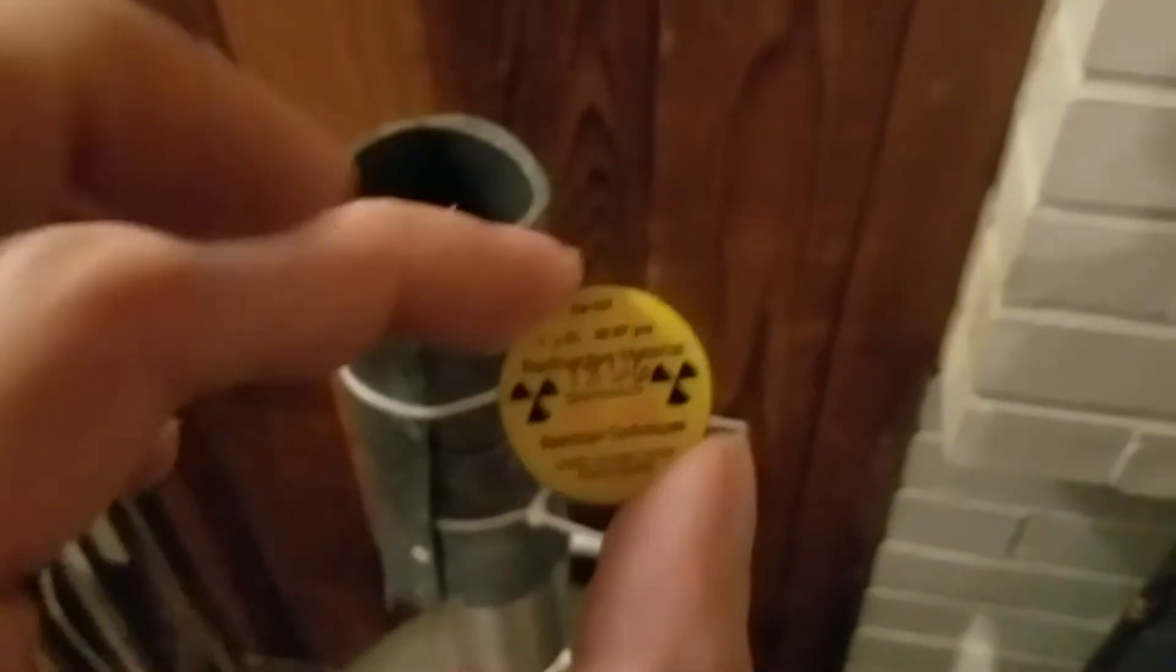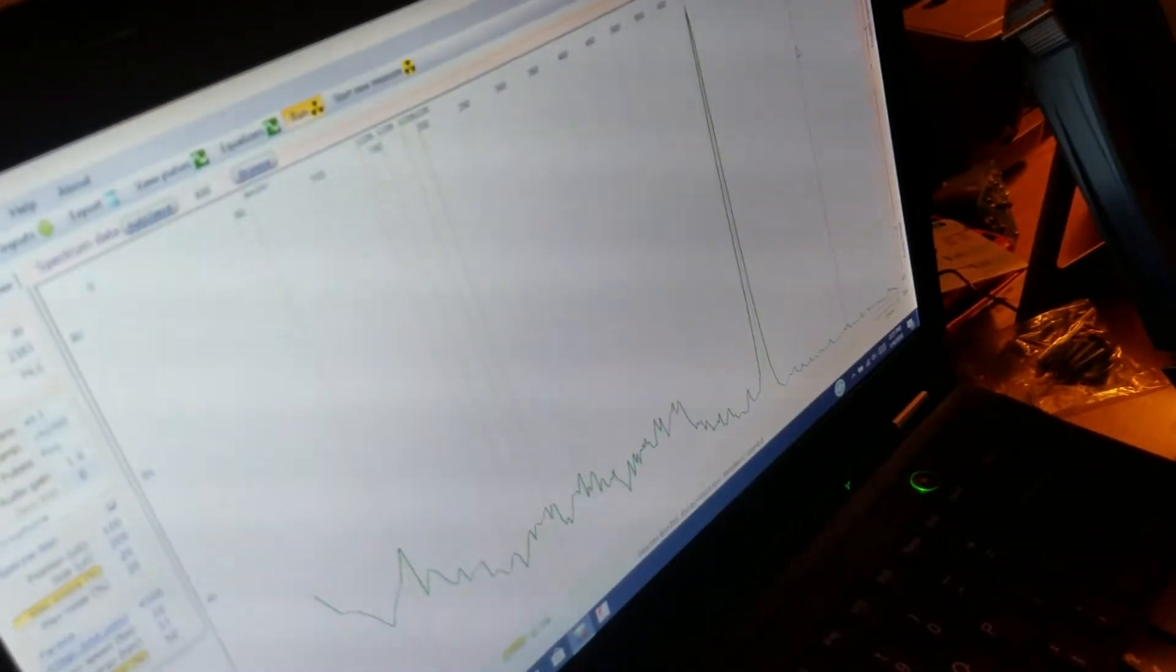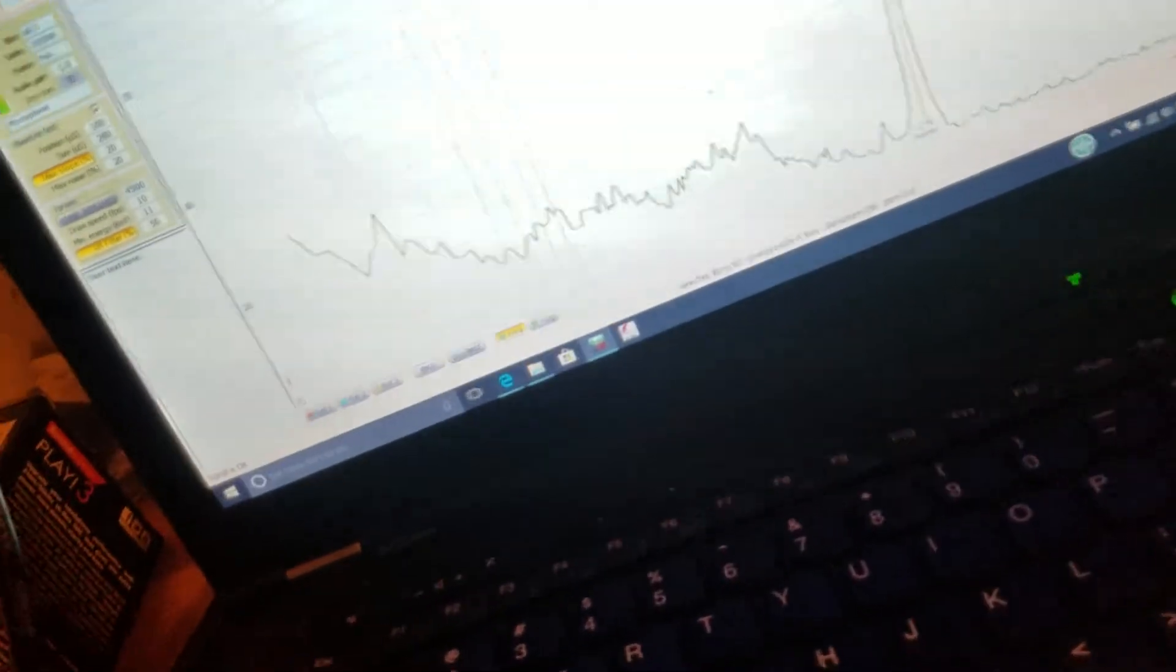Here's cesium. And there is the cesium line on the screen. You can check to see what kind of resolution we're getting with current settings.